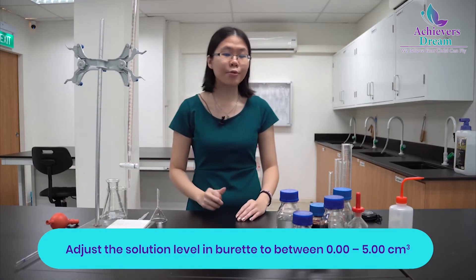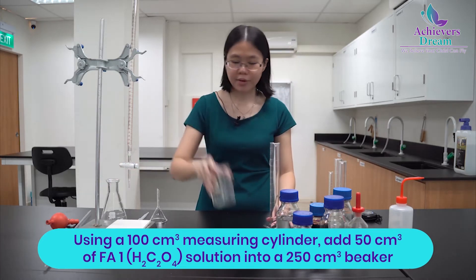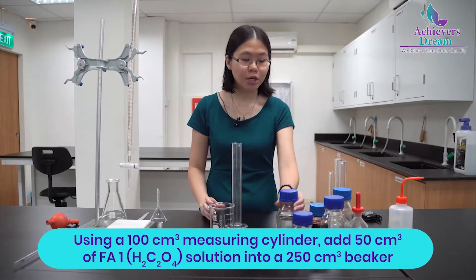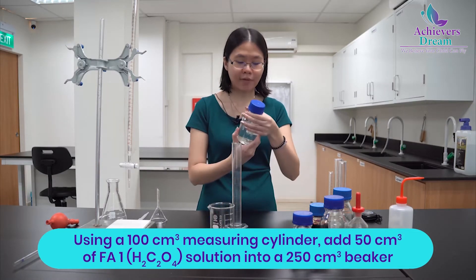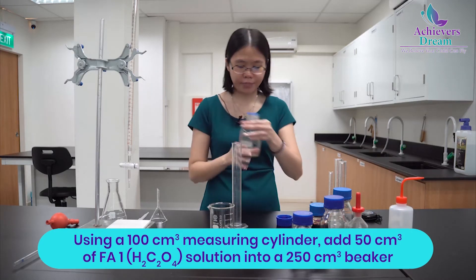Once you are done with your burette, take a 100 cm³ measuring cylinder and a 250 cm³ beaker. Using the 100 cm³ measuring cylinder, add 50 cm³ of FA1, which is your ethanedioic acid, into the beaker.